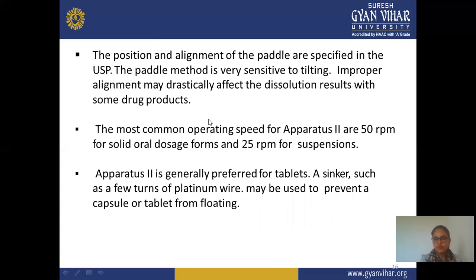If you don't set this in the proper way, or it is improperly set, then it shows some problem, a drastic effect, or some error in the dissolution result of this formulation. So you set this shaft in the proper, specified aligned way.